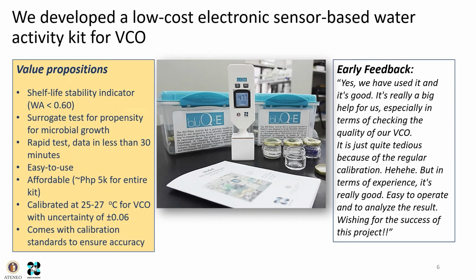Unfortunately, water activity is not usually measured because there's no availability of water activity meters, or they can be very expensive. So we have developed in our project an affordable water activity meter shown here, and this is a good test as a way to predict stability.